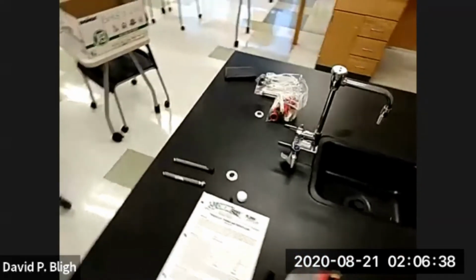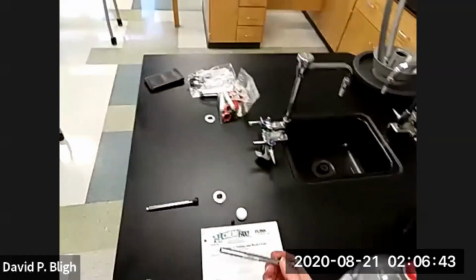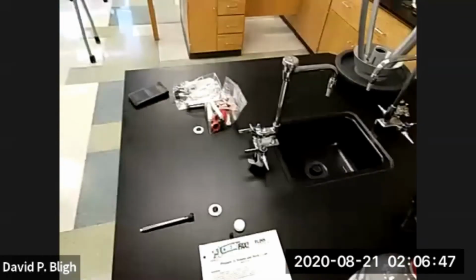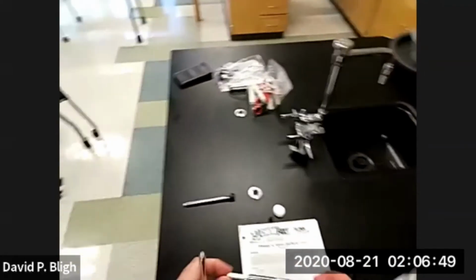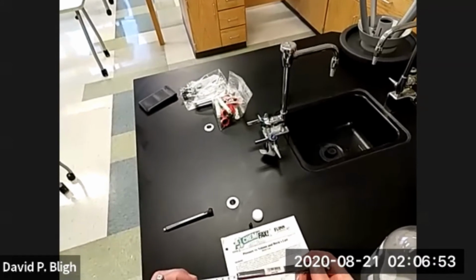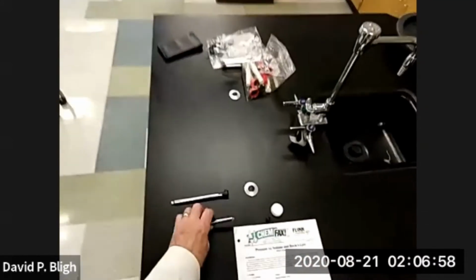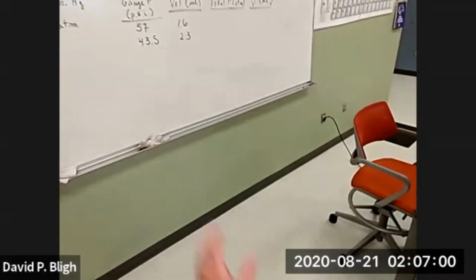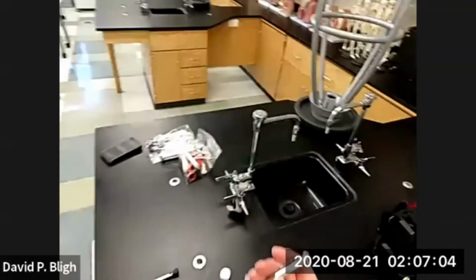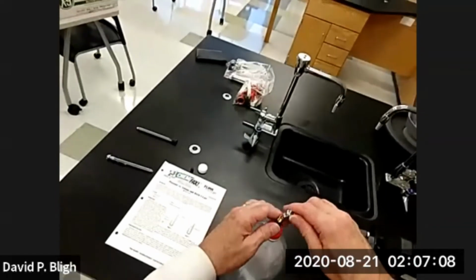Now, how do you know when to switch? Well, you want to use the most accurate gauge possible. So you look at the next one, which is going to be more accurate. The mid-range is more accurate than the high range. And you can pick this one up in the neighborhood of the high to mid-40s, right? So my guess is that since the last one was 43.5, this one's going to be well within the range of the medium and give you a more accurate reading. So we're going to switch to the medium now.